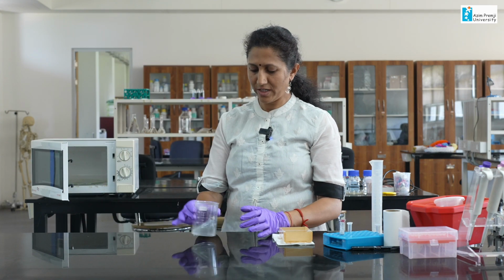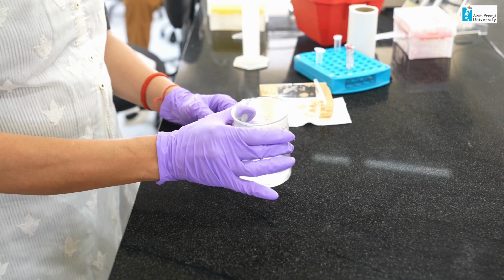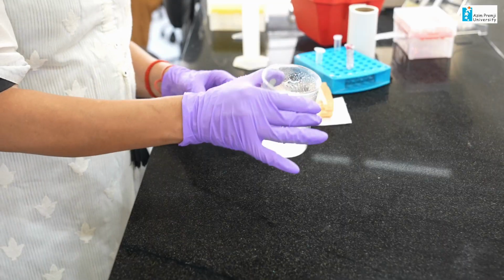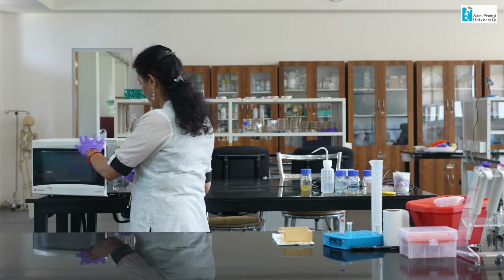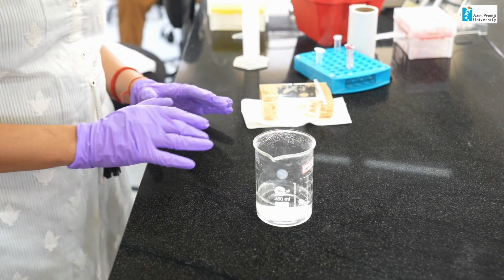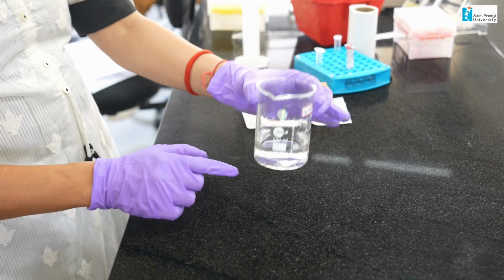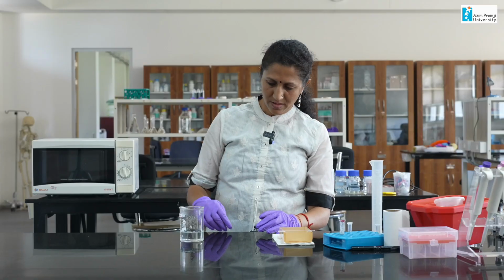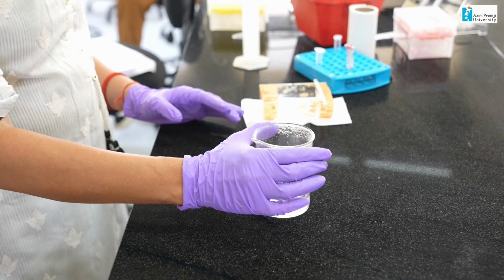You can see here now it has become much clearer, but still I can see the agarose sticking to the beaker. So, I have to heat it a little more till it becomes very clear. Okay, now you can see the difference. There are no more agarose crystals or particles. It is very clear, that means the agarose has completely melted.